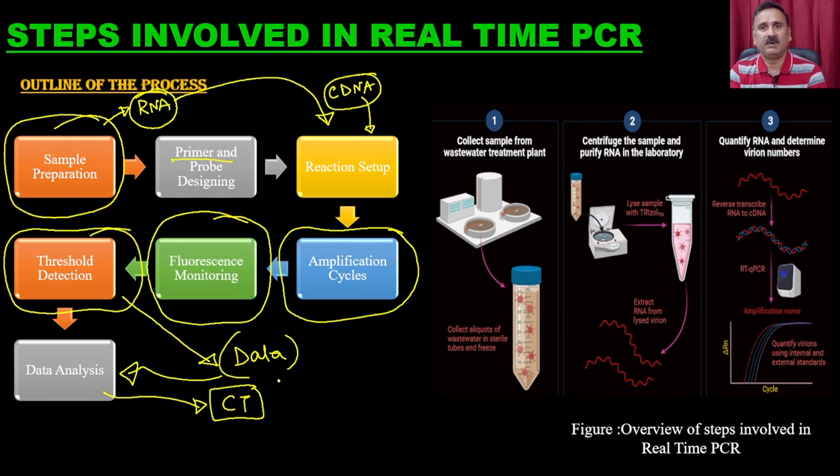You can know the number of cycles in which you have crossed the threshold and so on. So, we have prepared a small demo clip where the student is going to explain how you can compare the expression level of two different genes from two different samples. In this analysis, they have taken GAPDH as the housekeeping gene, which is not going to change from one sample to another. So that is going to be used for background correction, or for equalizing the two samples. And then they have also tested another gene for experimental purposes.